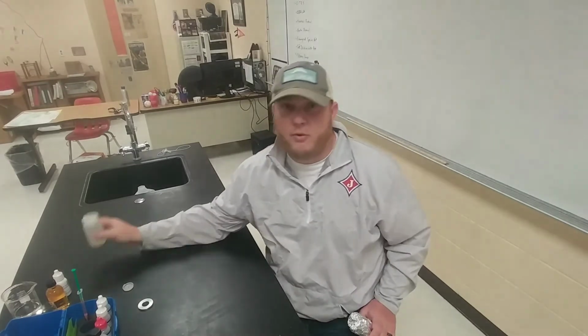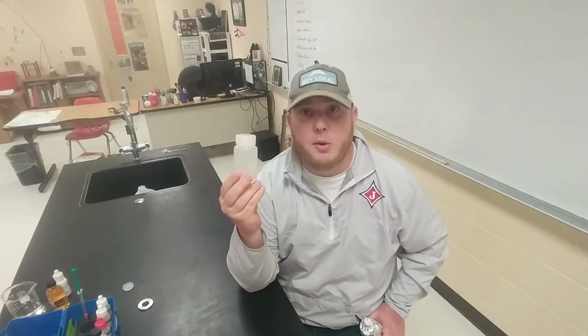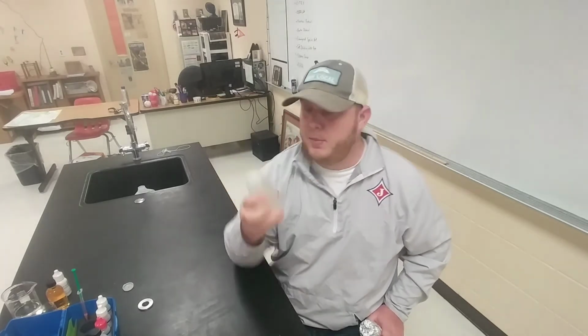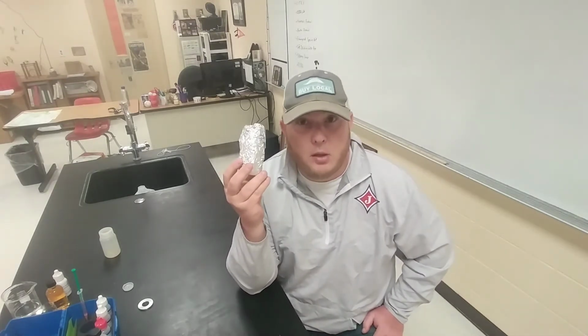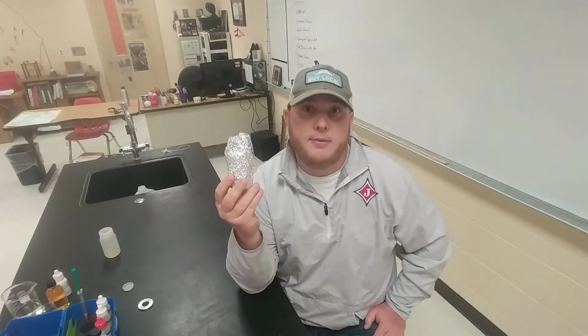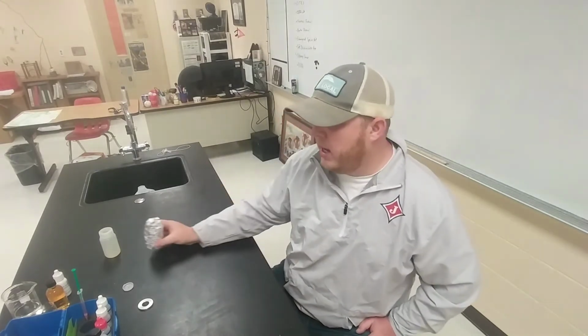So the sample before, the light bottle sample, which we took immediately after we took the sample, should have some oxygen content. We measure that in milligrams per liter. This one also should have an oxygen content, but it should be lower because all the oxygen in here has been used up over the past 5 days by these microorganisms decomposing all the organic matter.